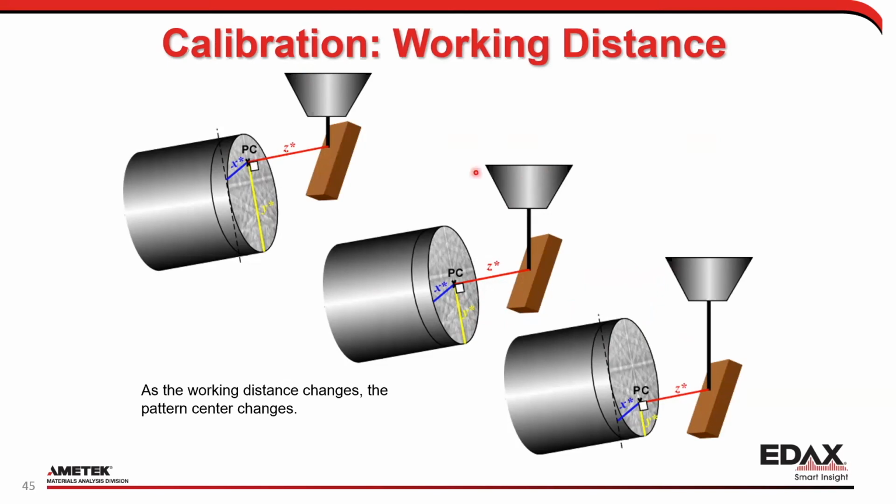In general, you don't have to worry too much about calibration because the geometry is relatively fixed. What a calibration is basically doing is finding the geometry between your pole piece, your sample, and your actual detector. In the end, the only real variable should be where your sample is, and that's what we're doing the calibration curve for. Your detector should basically always be in. This is not always true; I'll talk a little bit about that with Apex.